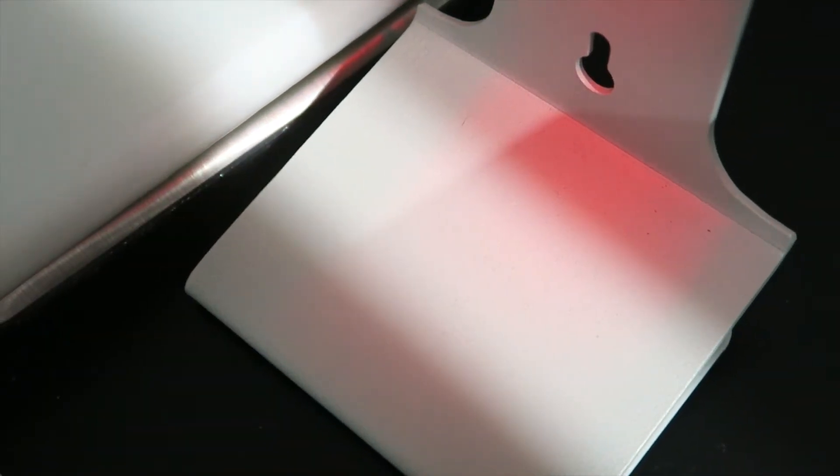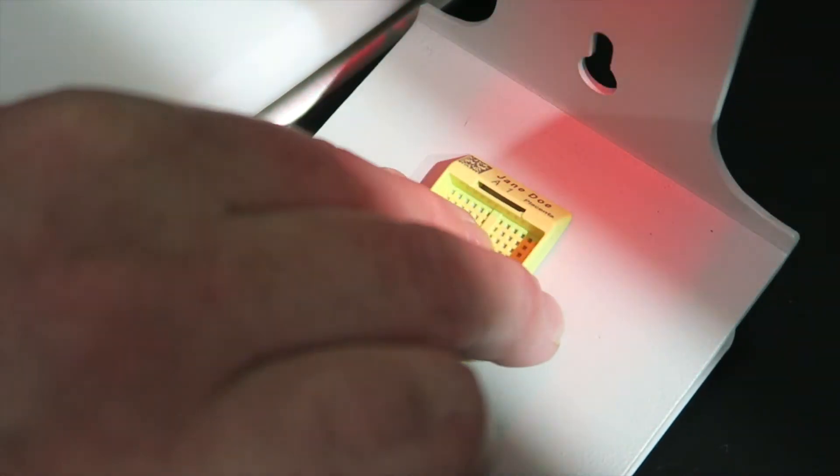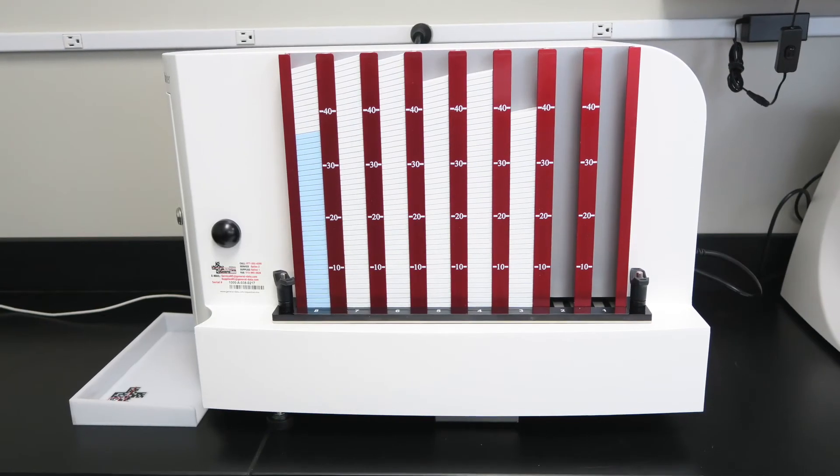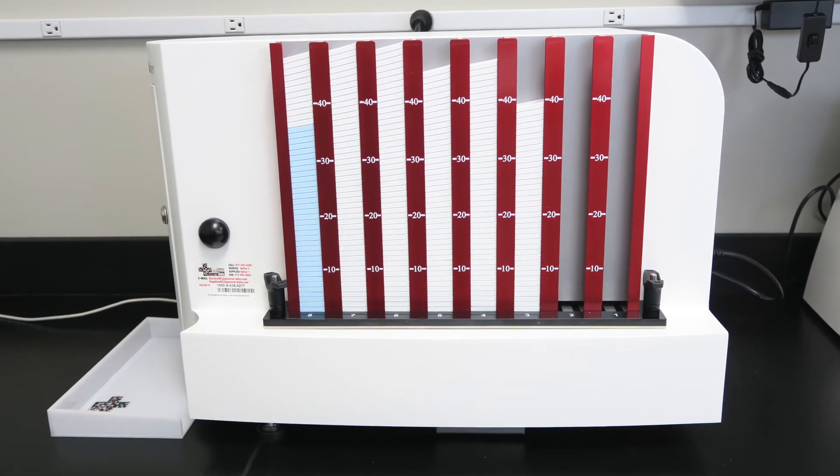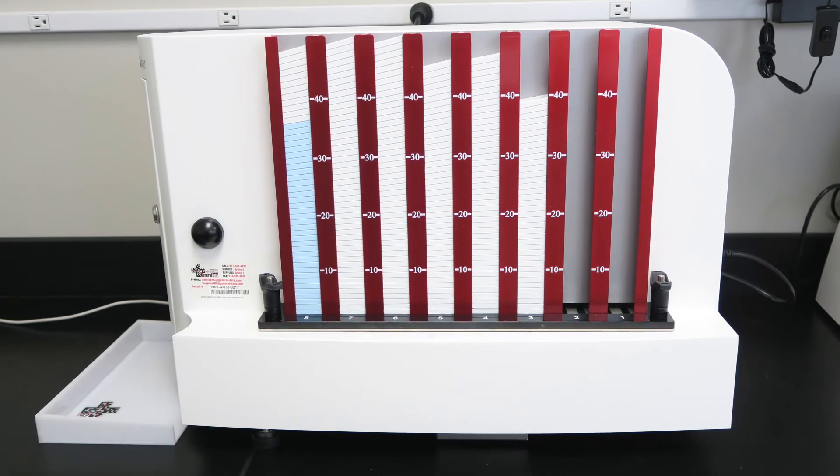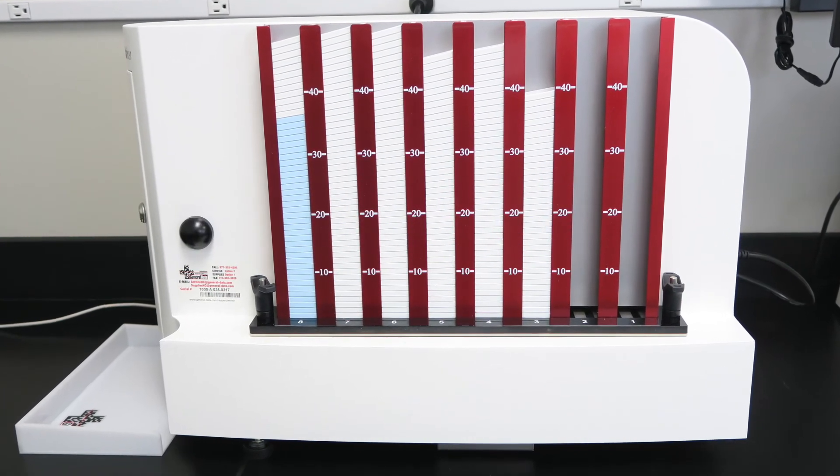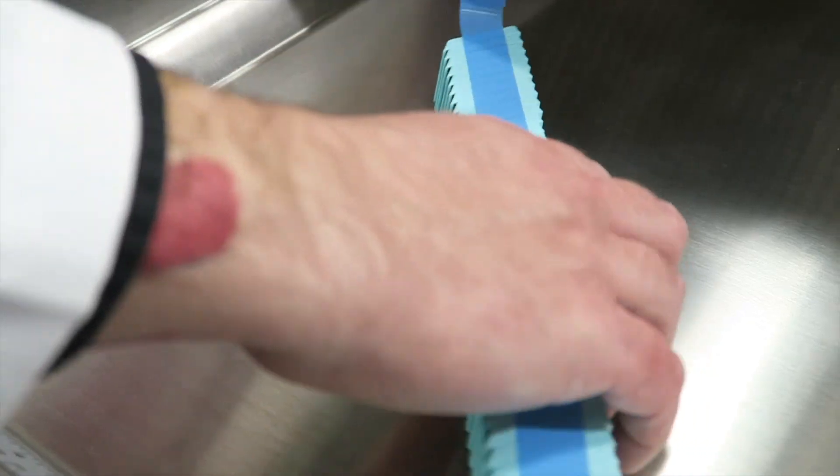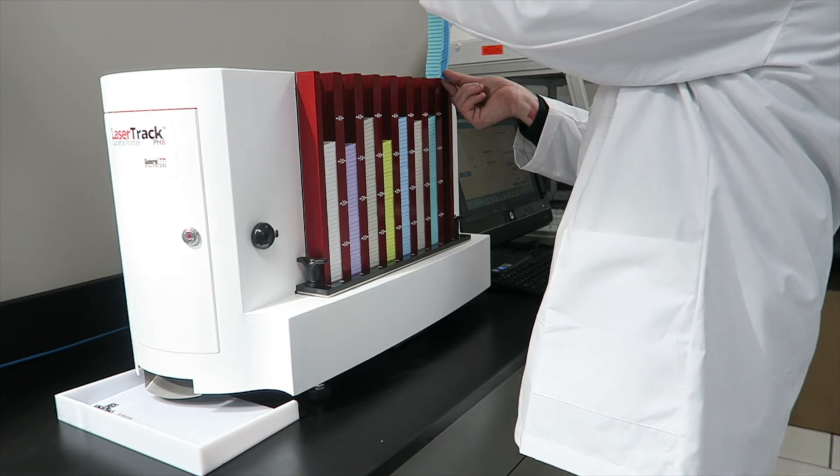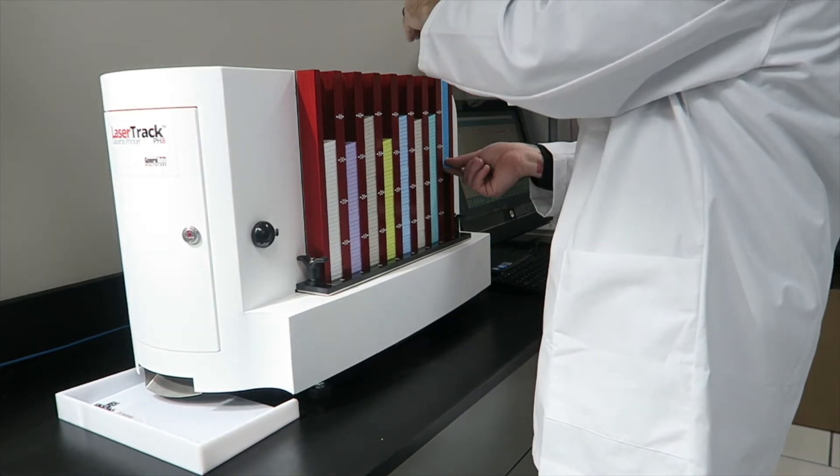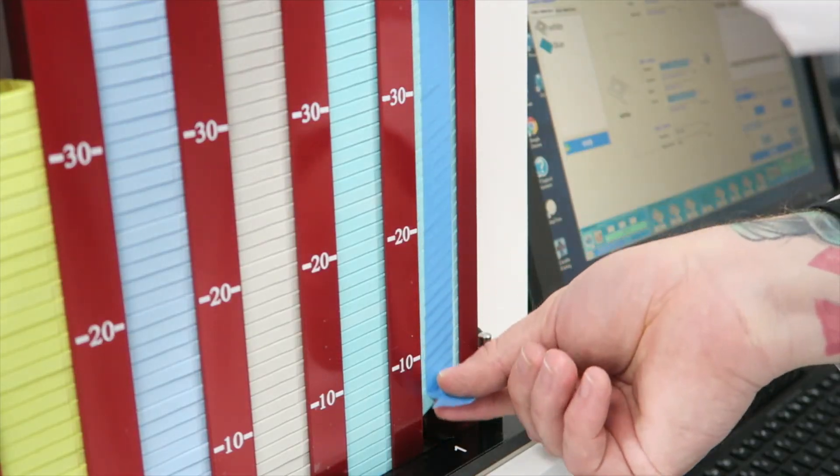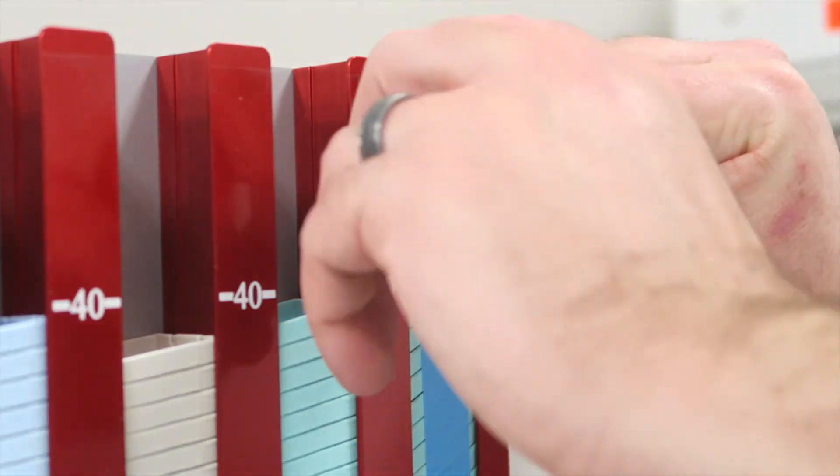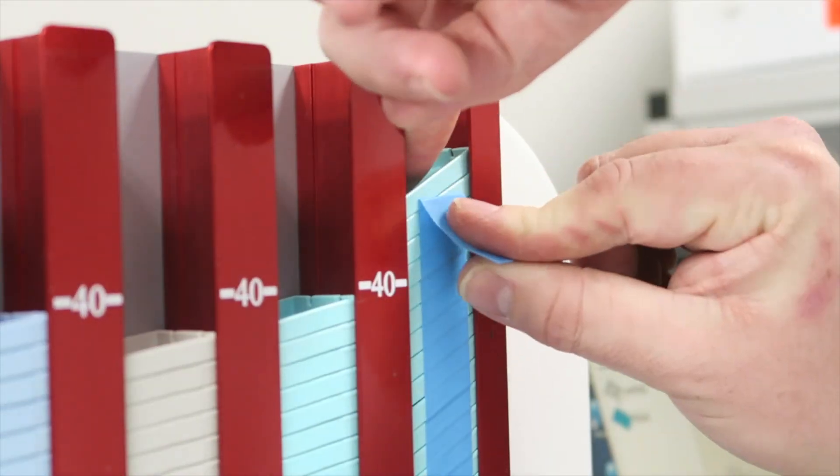Eight cassette magazines each hold up to 60 cassettes, for a total of 480 without refilling. Cassettes load easily into each magazine and come in handy pre-taped stacks for easy dispensing. All the operator does is fill and pull.